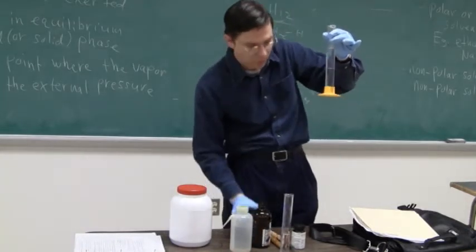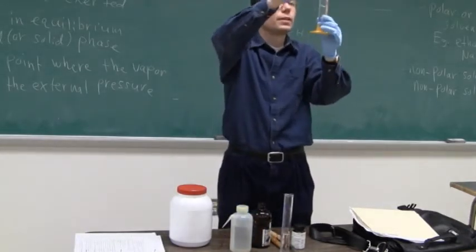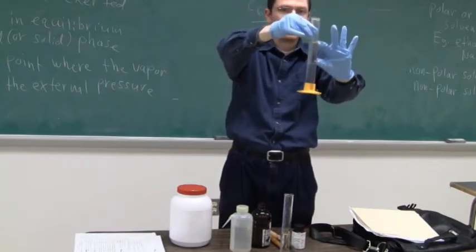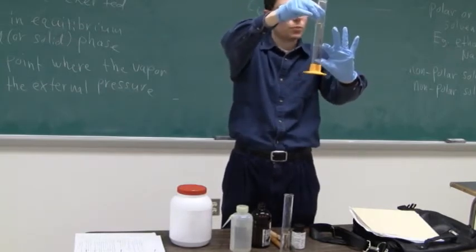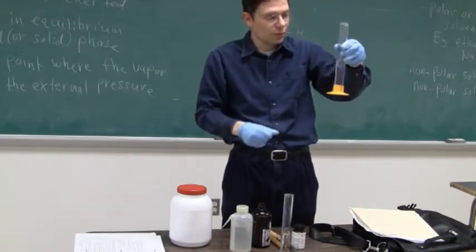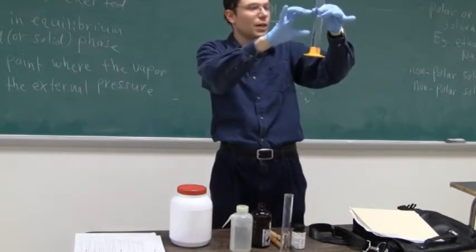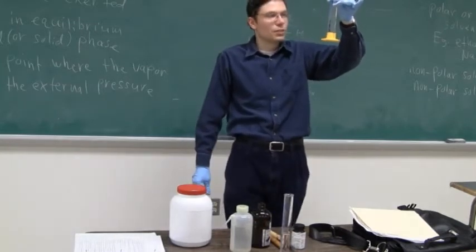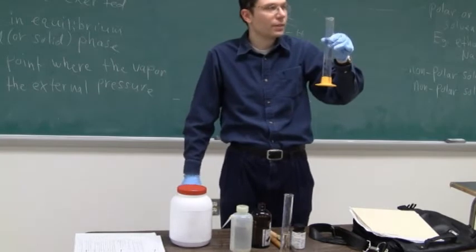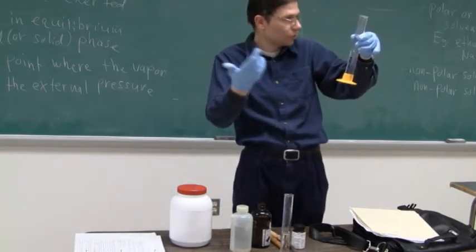Alright, so we have two layers here. You can see there's one here, put it down low so the camera can pick it up, and there's one here. So the cyclohexane actually is on top. And just as a side note, there's a reason why the cyclohexane is on top and the water is on the bottom. Does anyone know why the cyclohexane is on top? Yeah, actually. Less dense. Less dense, that's right.